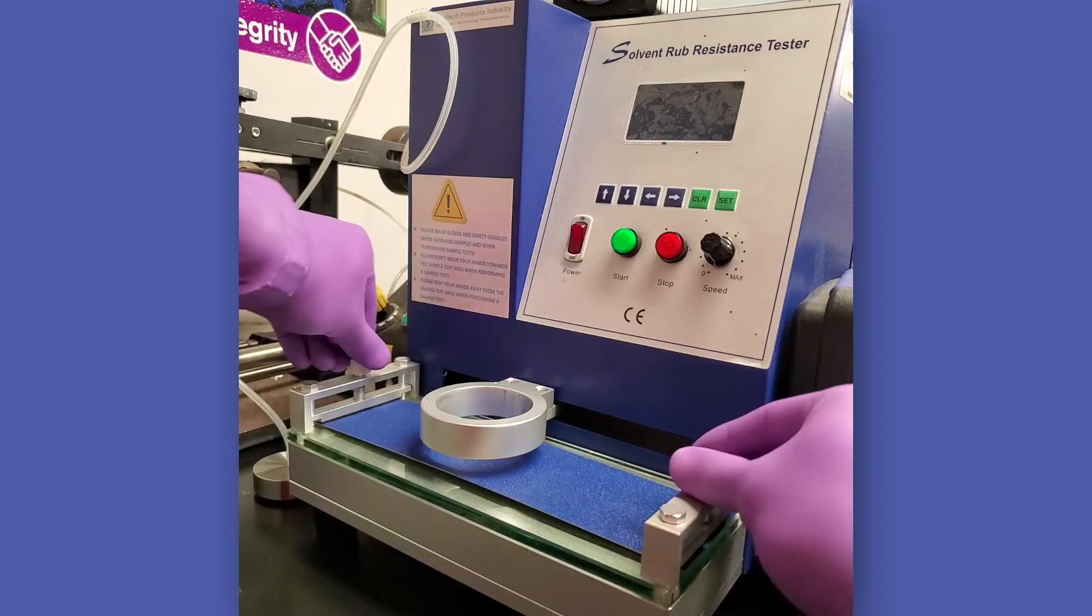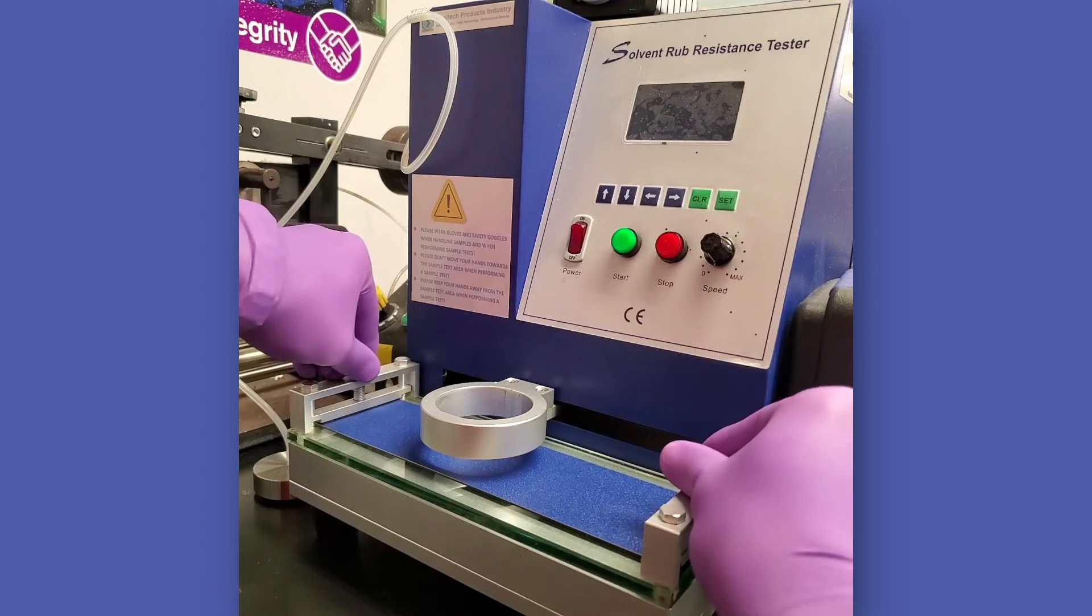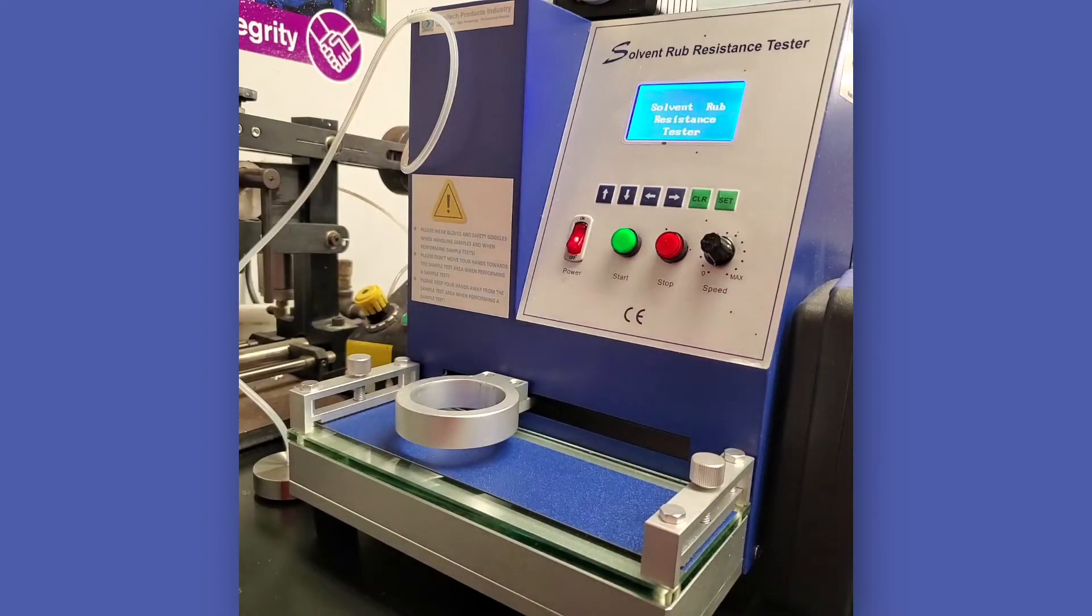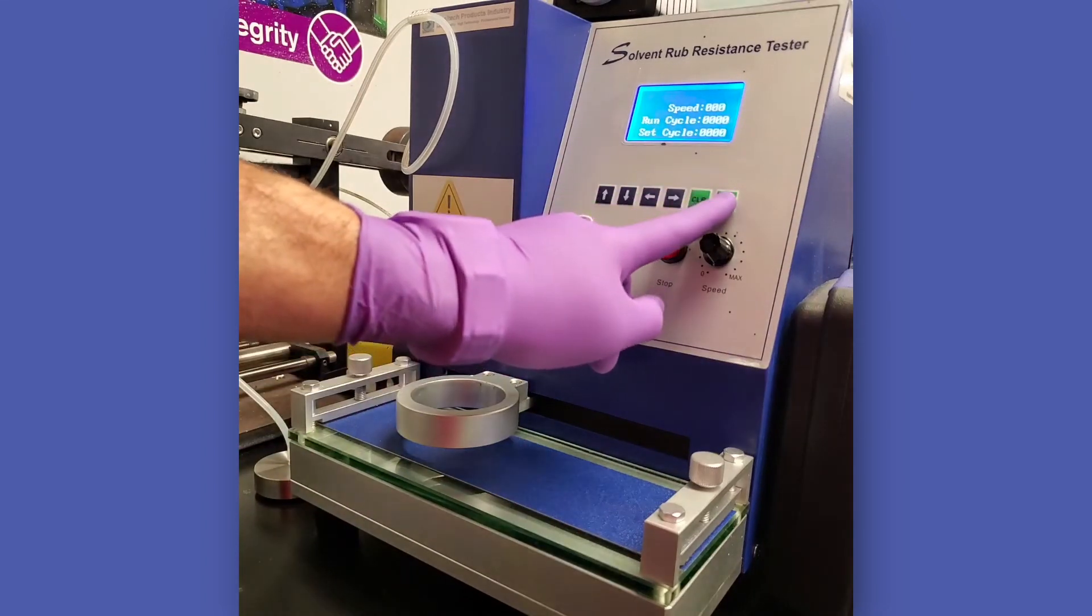Clamp the panel to be tested into position with the long dimension parallel to both the rubbing direction of the machine and the rolling direction for coil coatings in accordance with the machine manufacturer's recommendations. Set the machine counter to the desired number of rubs.